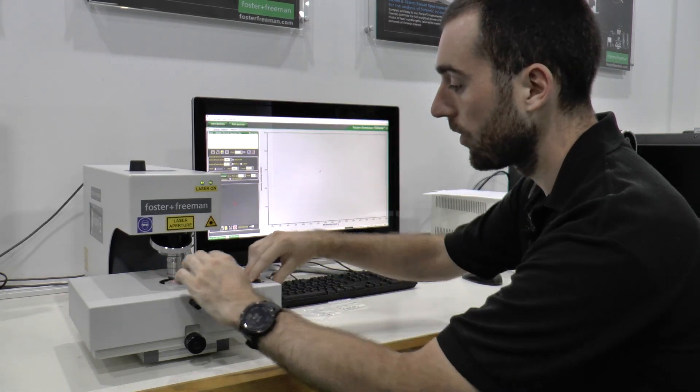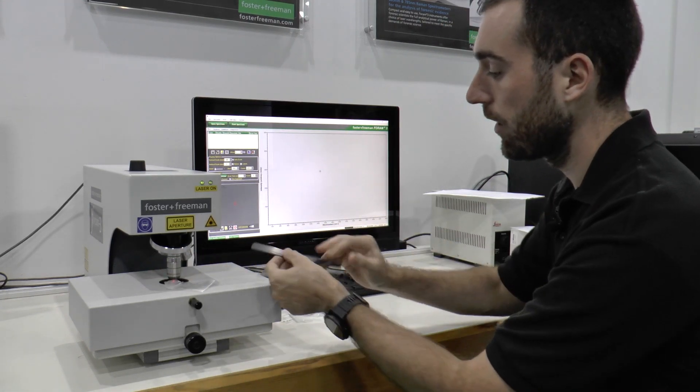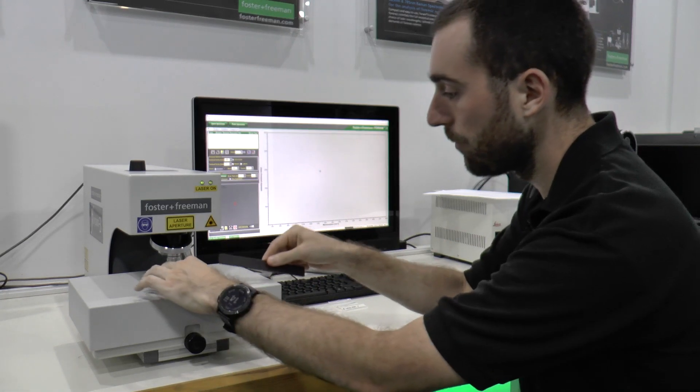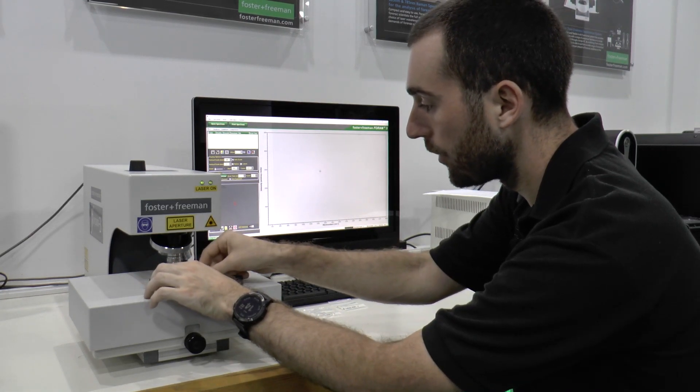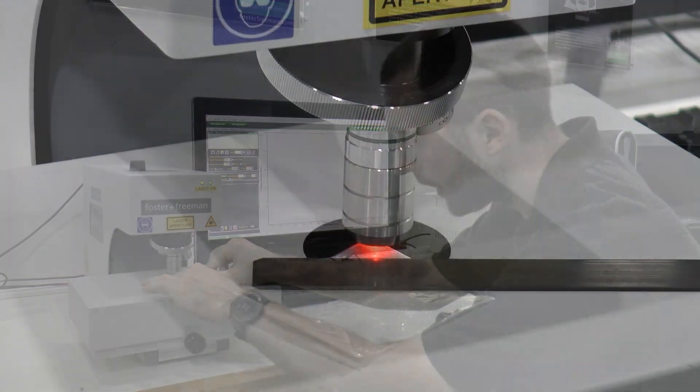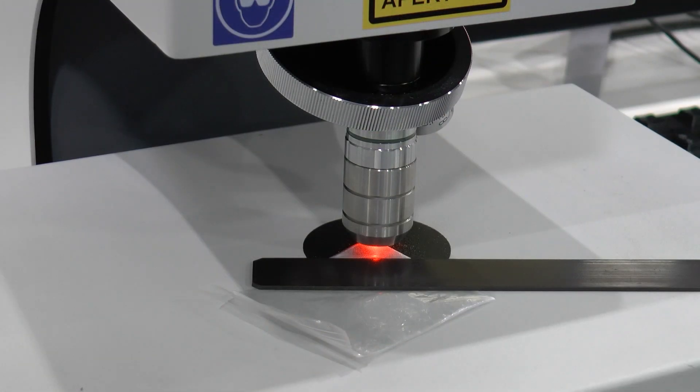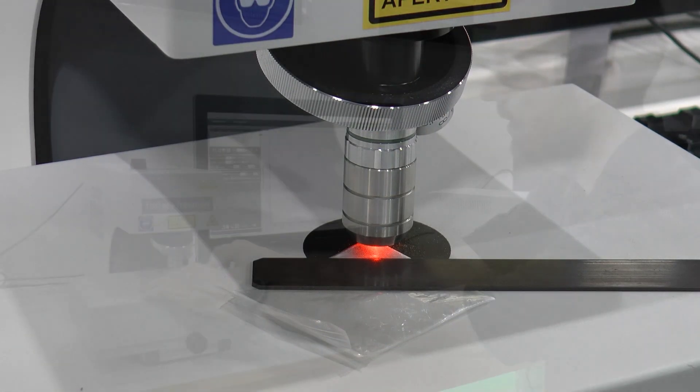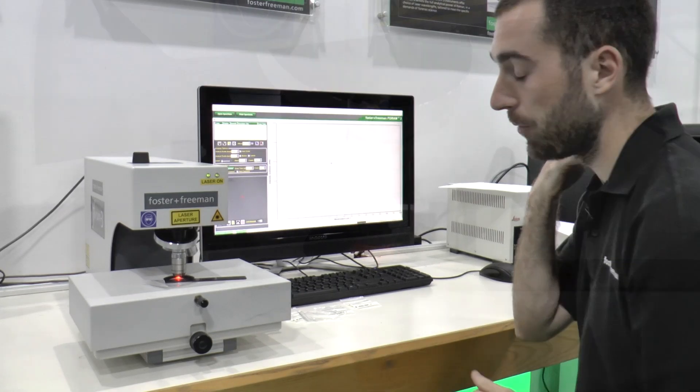I'll place this on the stage itself and we can use these magnetic strips just to hold our sample down and then place this into position beneath the objective.